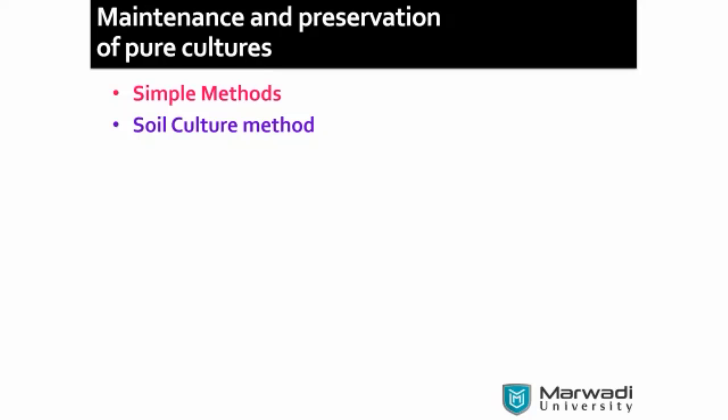Even on plates, whenever you are using plates, they are sometimes wrapped with plastic. Tapes are also different. Paraffins are also coming. There are so many other things people are using. Earlier people were using just wax. Okay, the candle is there. Just you may put a drop down. It's like a sealing with the wax. It's easier than the previous method. So there is nothing special in it.